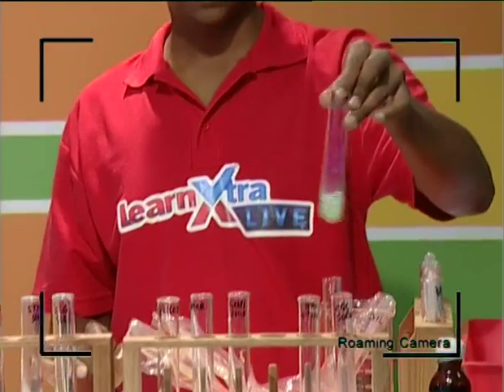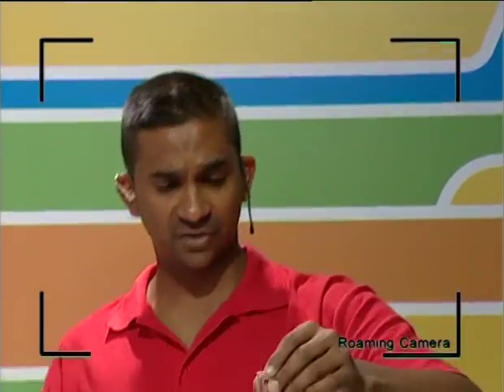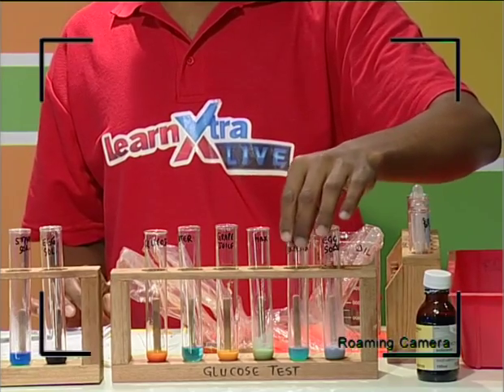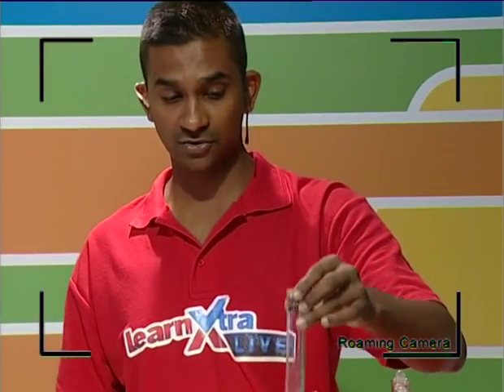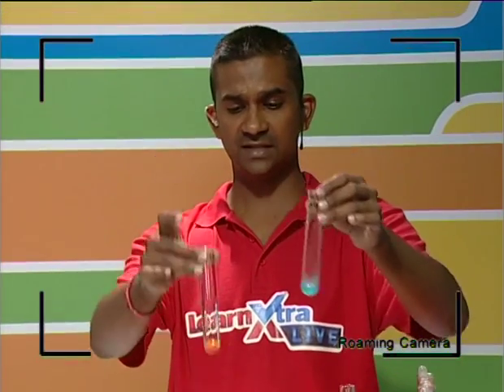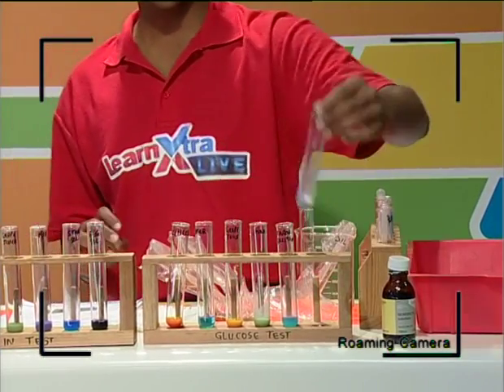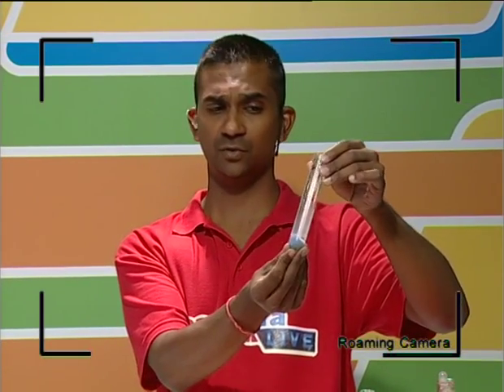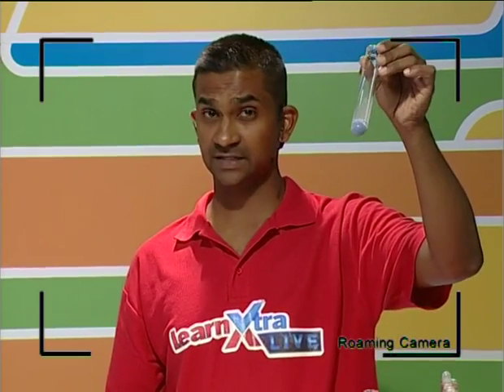When we looked at milk, guys, it's not a specific orange color, but it's got a greenish tinge, indicating the absence of glucose in milk. We then tested starch, and we know that starch is a polysaccharide, and it's not glucose, which is a monosaccharide, and hence, compared to the positive control, this tested negative, indicating the absence of glucose in the starch solution. And then finally we looked at the egg solution. It's already solidified, because remember we put it into boiling water and the protein agglutinated, it became thick. But again, a negative change in this.